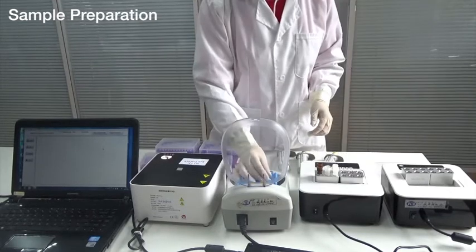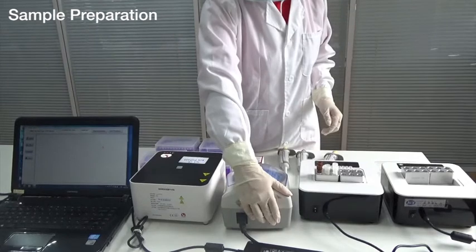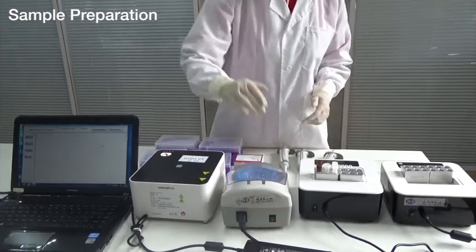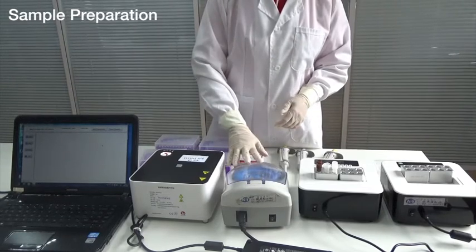Re-centrifuge at 13,000 revolutions per minute. Use 5 microliter supernatant for PCR.